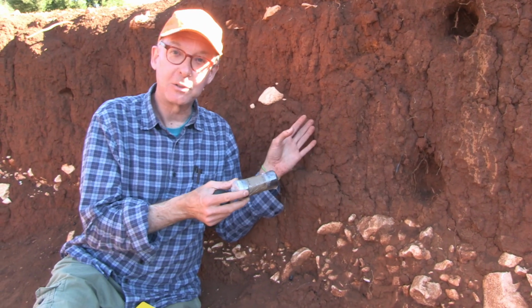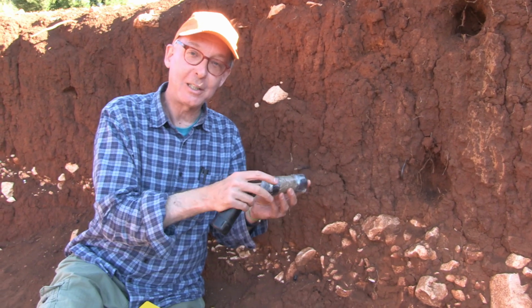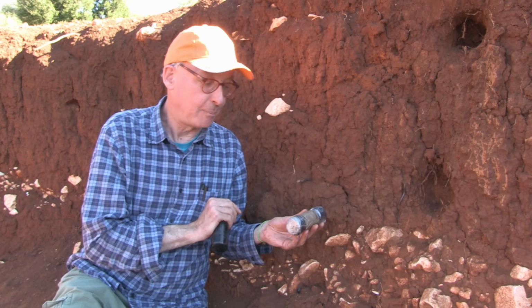And we have to do a measurement of that. And so we need two things. We need to measure the amount of dose that's been building up in our mineral grains, and also we need a measurement of the radioactivity at the place where we collect the sample.